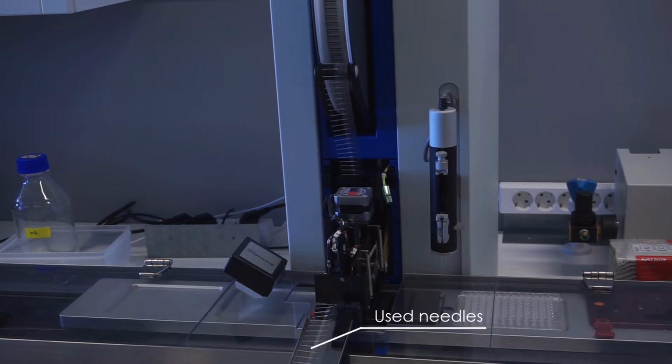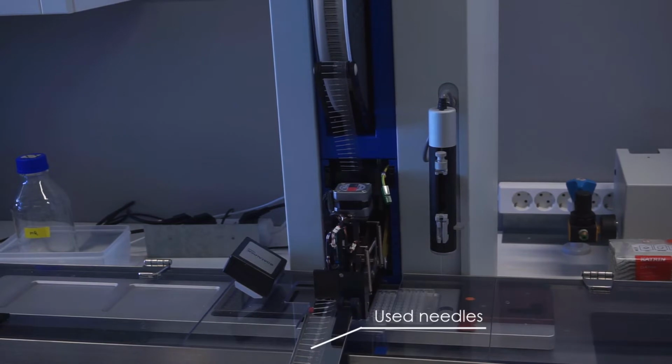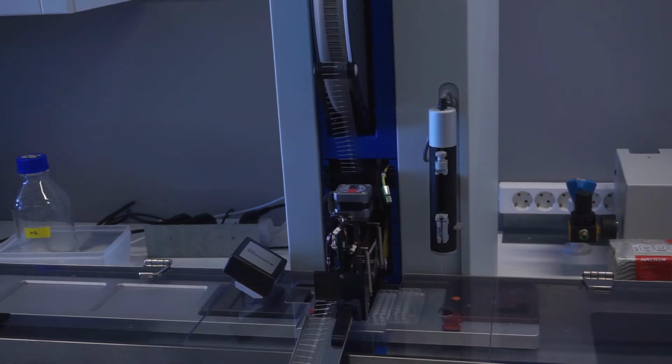Make sure the used needles are collected into the yellow bin. Avoid touching the needles with your bare fingers. They are sharp and might be contaminated.